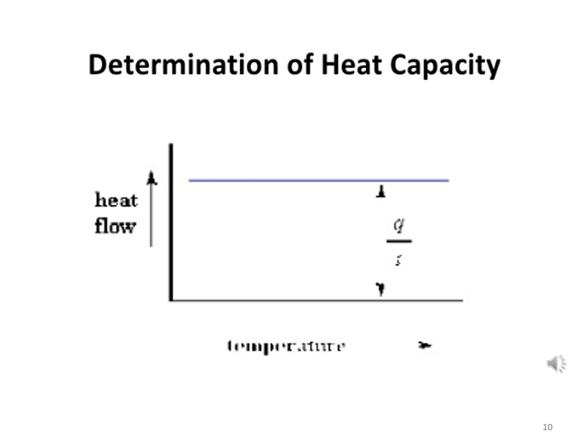So next, if we are using a DSC analyzer, we can determine specific heat from it. So the next topic is the determination of specific heat or heat capacity. Specific heat, or we can also say heat capacity, is represented by Cp.